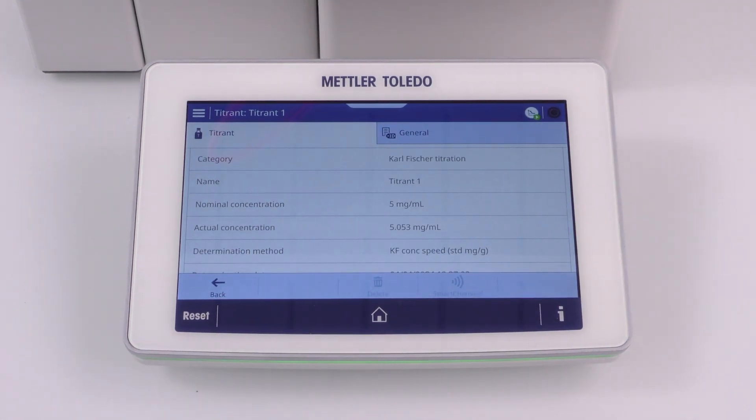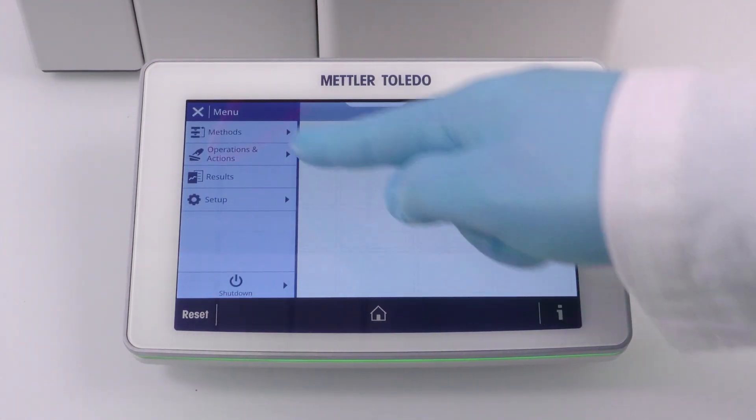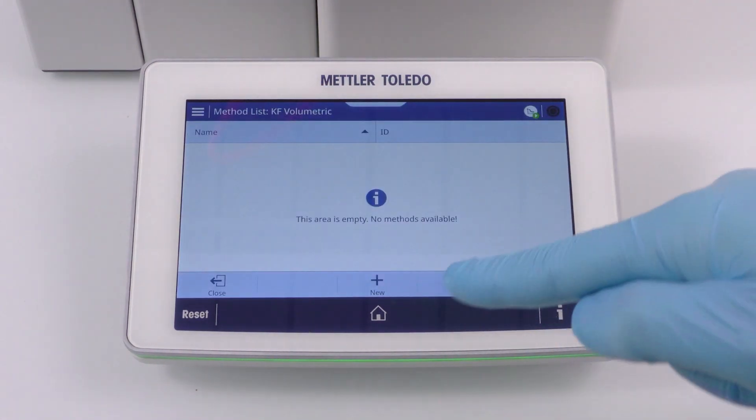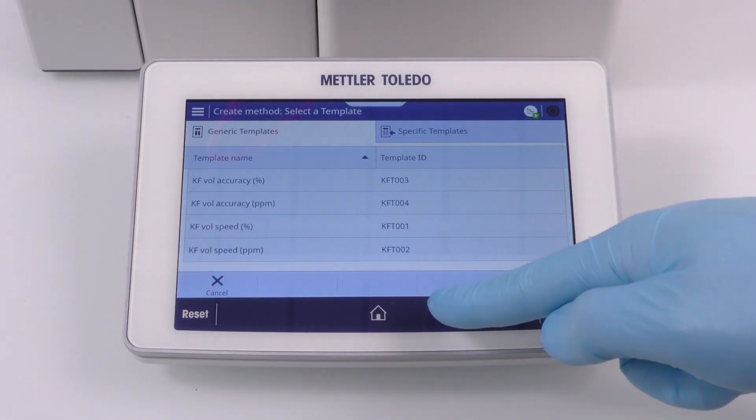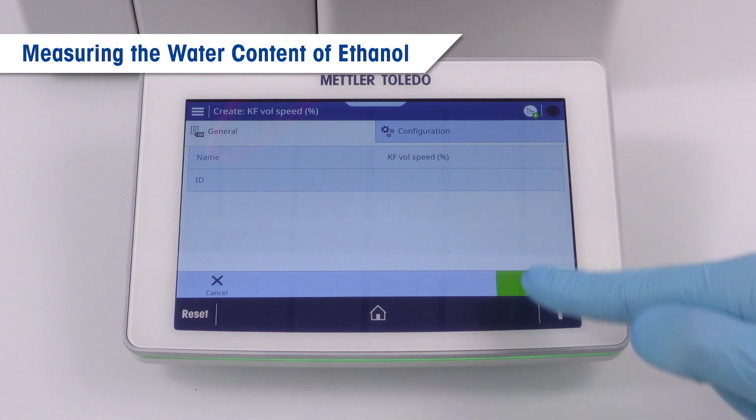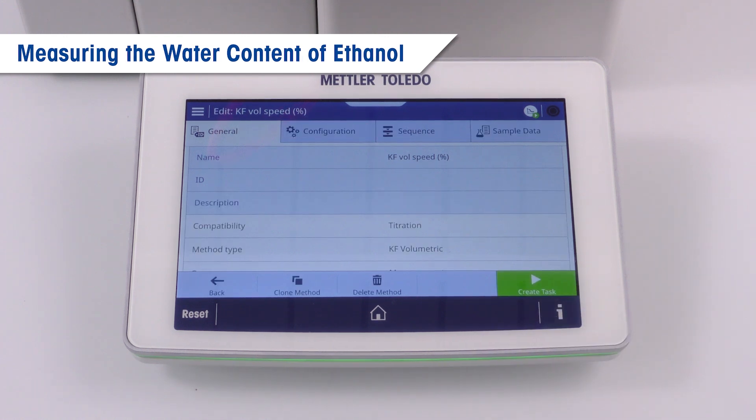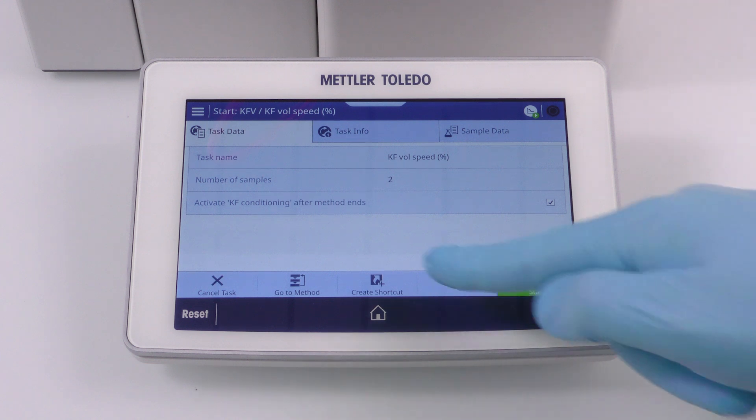The next time you use this titrant resource for a titration, the corrected actual concentration is used for calculating the result. Having the actual concentration of the titrant determined, we are now ready to accurately measure the water content of a real sample. In our example, I want to know the water content of industrial alcohol. A very easy sample. Similar as before, we create a method and shortcut. However, this time we are using a template of type KF volumetric.